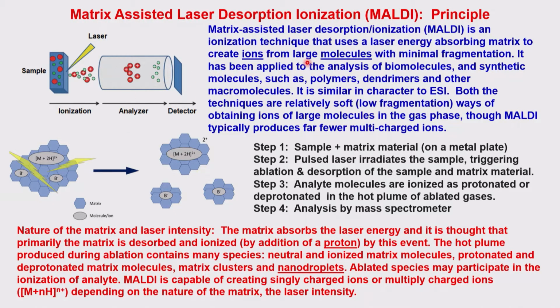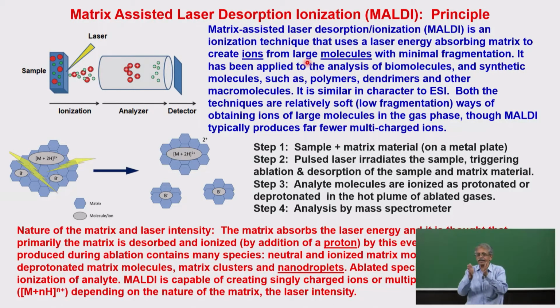And such a technique is useful for bigger molecules, large molecules like polymers, polypeptides, proteins, nucleic acids, carbohydrates, a variety of biological systems, synthetic systems, somewhat complex small molecular systems. All of these can be studied. The important thing is that you can ionize these without disturbing their intermolecular interactions. That means if the proteins are associated as a dimer, trimer, tetramer, you can still find them, even compared to the ESI method. So it is more or less equivalent to the ESI method, maybe even better in terms of the ionization process, that is much softer for MALDI as compared to ESI, which makes it possible for a researcher to look at the details of the molecular aggregation, even in proteins, peptides, etc., or any biomolecules, without their dissociation, and that's a very good factor compared to that.